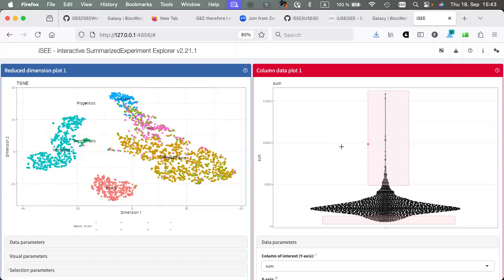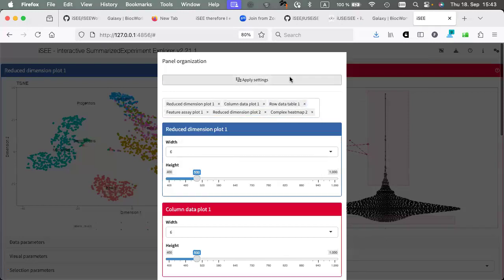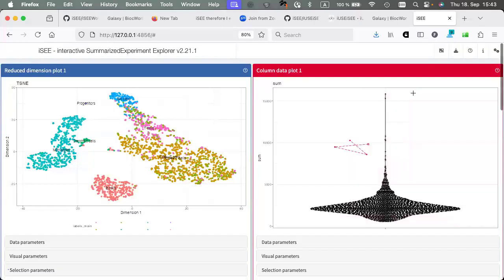Like clicking here or clicking somewhere else. You can simply move this one here and move this one back, and that should normally clean the selection. This still stays somehow, this kind of scribble, which is not closed. That's the thing.